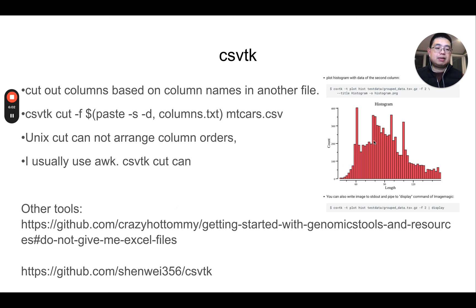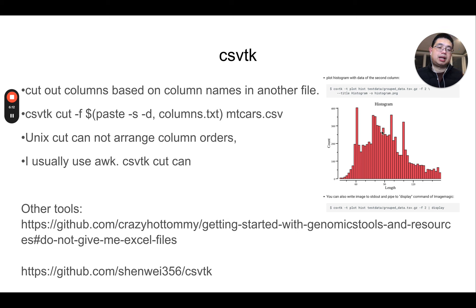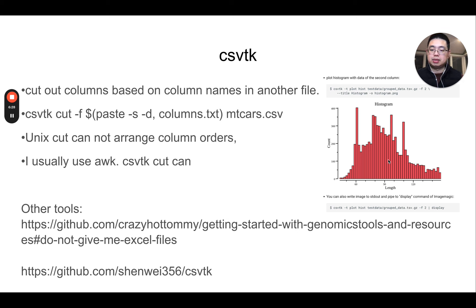Even more powerful, you can make plots in the command line. You can use csvtk plot to plot histograms and scatter plots and display them right in the terminal. Although I usually use ggplot2 because it's more flexible, this gives you an alternative to visualize your data in the terminal. Get the link to download it.